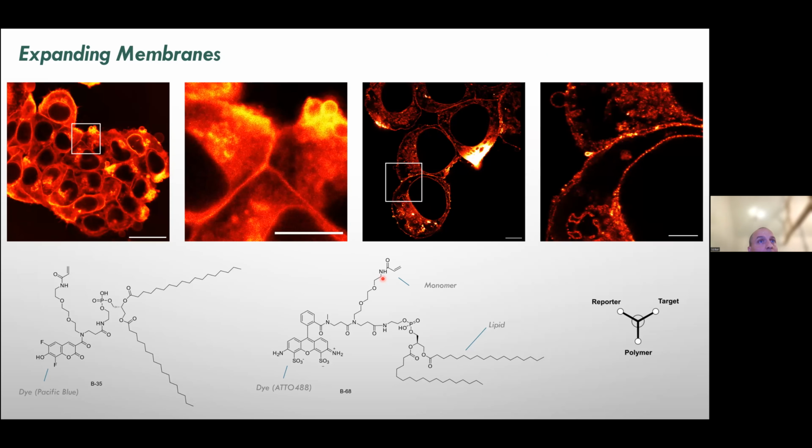Moving to other biological systems, membranes. We were the first back in 2019 to show that you could address membranes with ligands. Here you see pre-expansion. Everything is a bit stained and blurry, but after expansion, this clears up nicely. You can clearly see double membranes, sprouting vesicles here, and then onto the design.